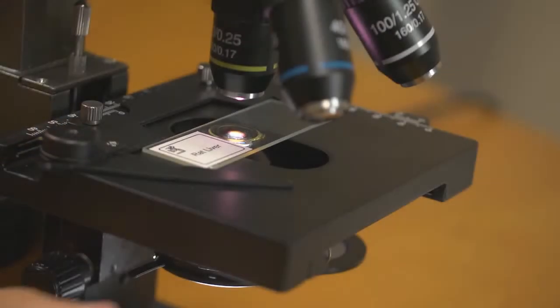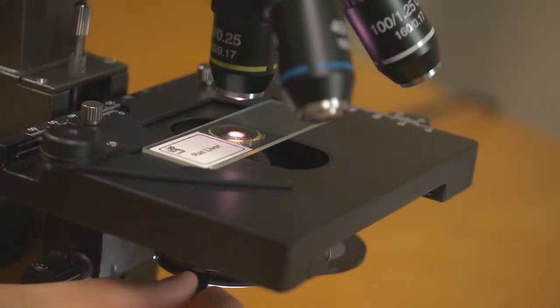To optimize your image, we've taken light control one step further by adding a diaphragm iris to limit the amount of light coming through your microscope. This comes in handy when adjusting an overexposed image or trying to see details you may have missed otherwise.